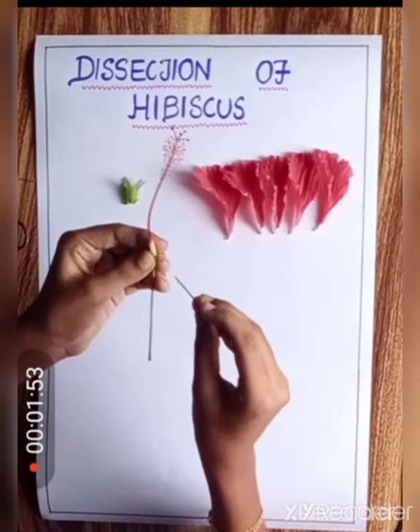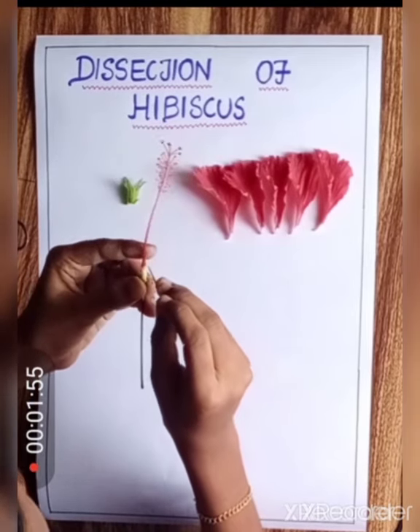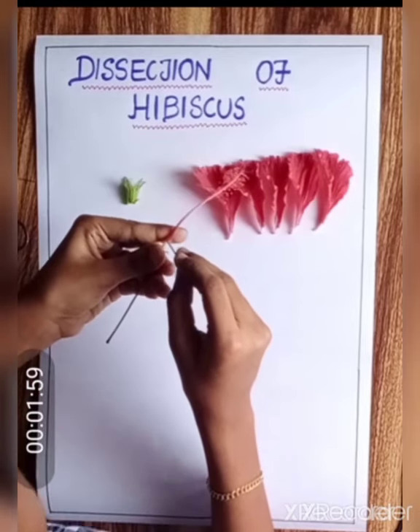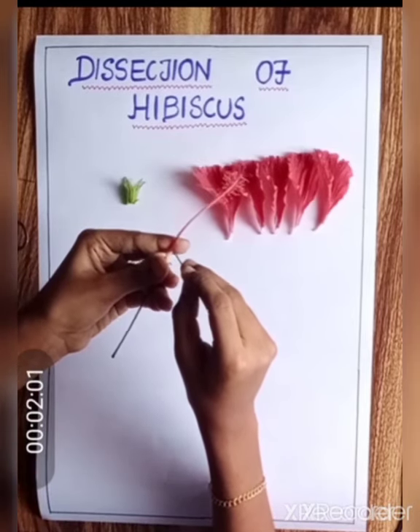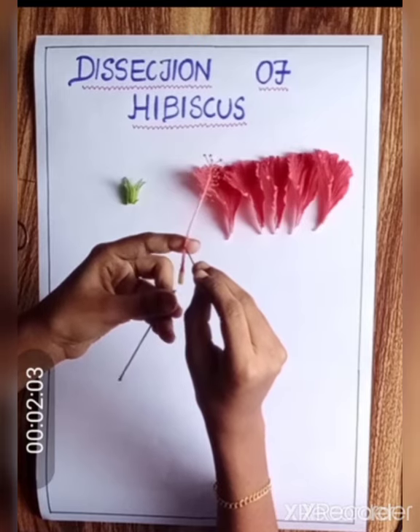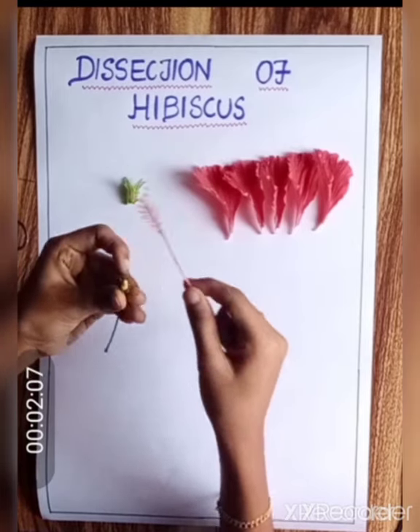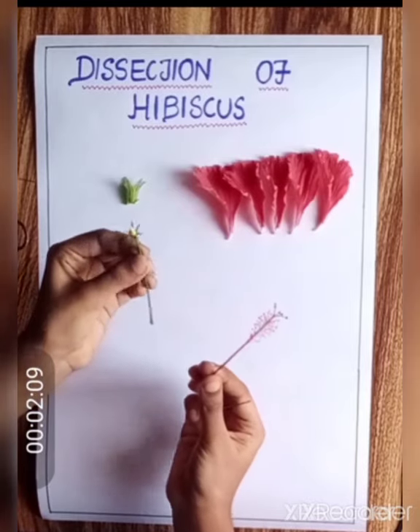The style of the flower is split open. This is the ovary.